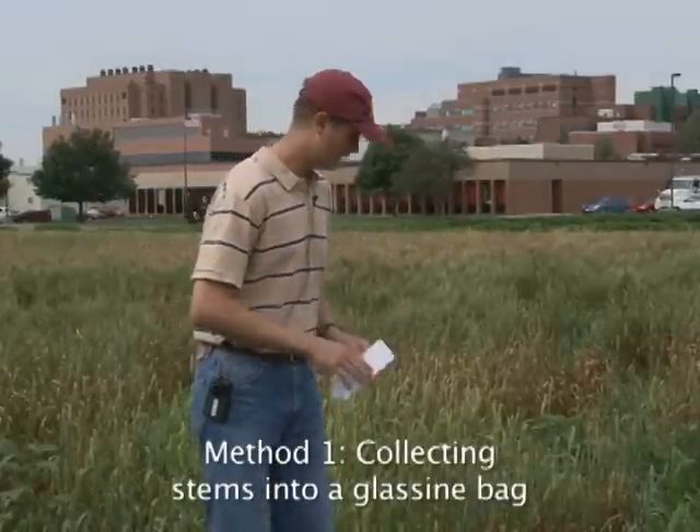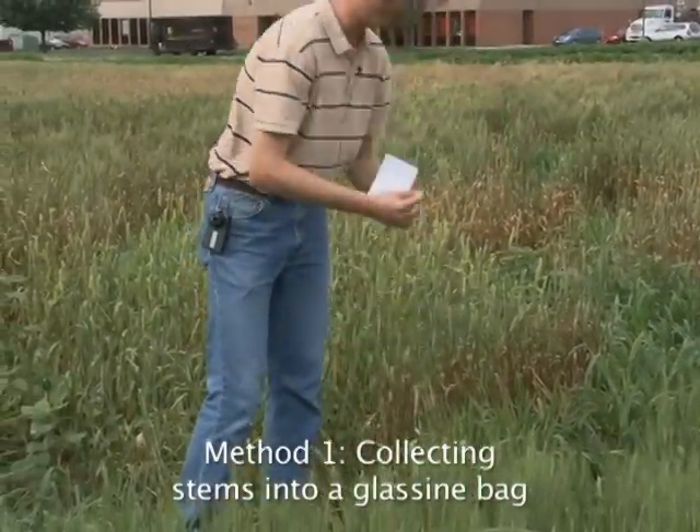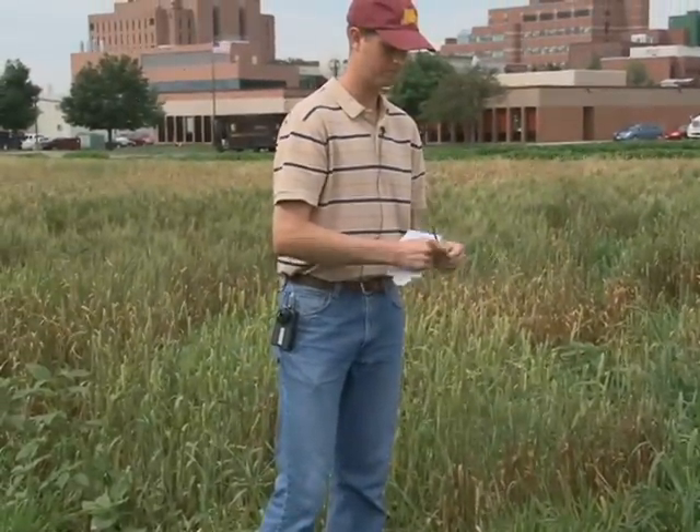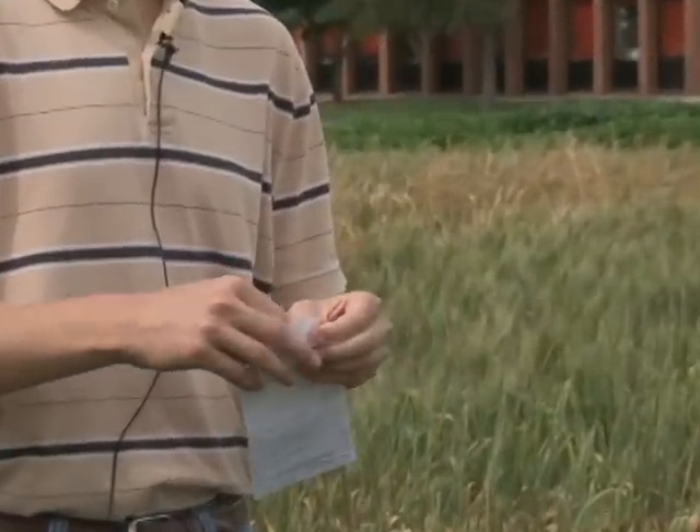Simply, you can find wheat that's infected with stem rust, break off a few stems, and insert the pieces of the stems into the glassine bag.